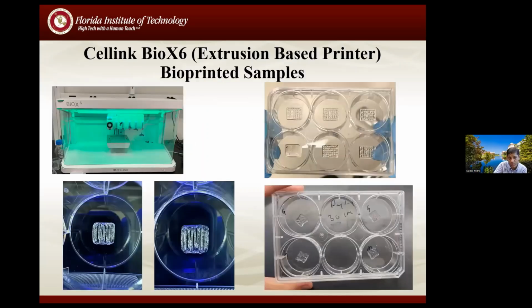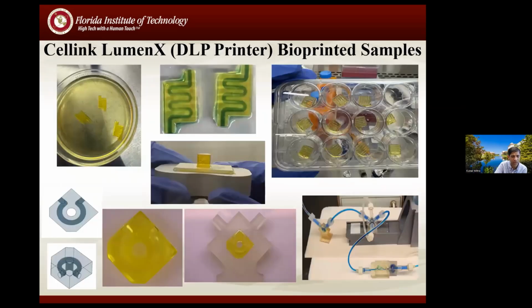I'm going to focus next on a few, because the focus is on space, on the microgravity environment. We are still waiting for some flight experiments, but we thought the key is printing in a simulated microgravity environment, what we did there. And these are some extrusion printers. We also have digital light processing. You can see that we have actually printed much more advanced structures, but those are papers under review.